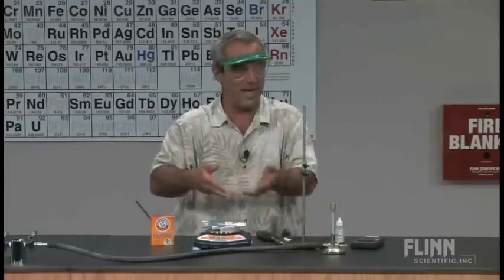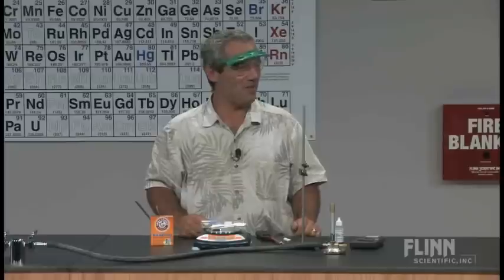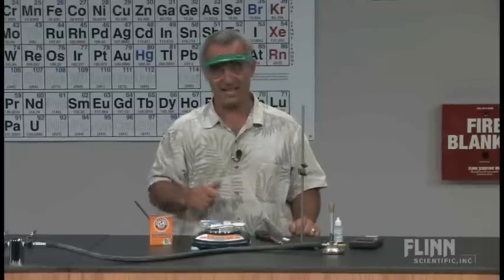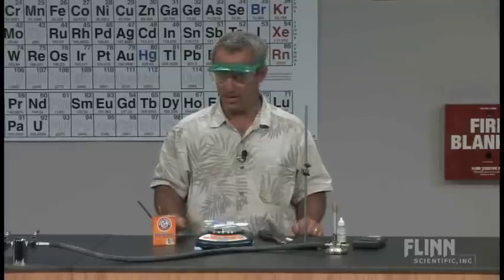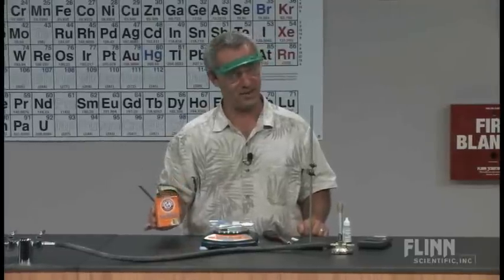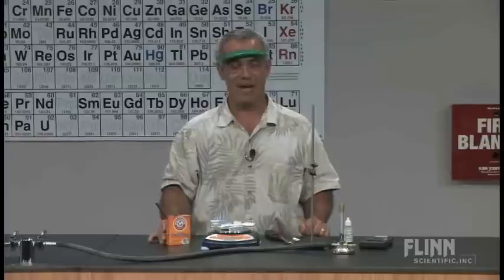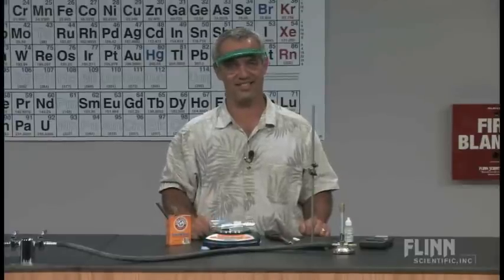You know, this is a matter of the scale. They really do give high fives, they celebrate. That's a 10 out of 10 right there. So, a nice little stoichiometry lab, one that involves heating baking soda, seems pretty simple, and one that gives really nice results. Thank you.